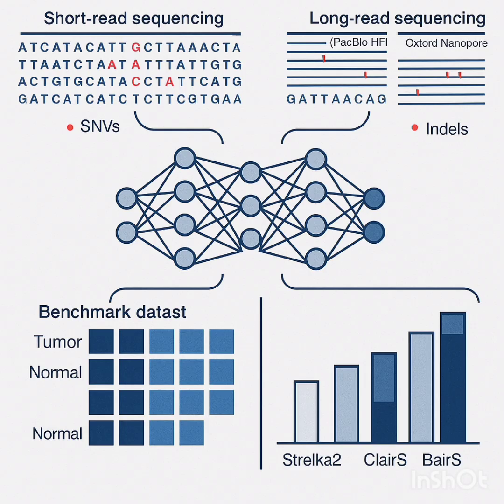They added 263,591 new high-confidence somatic variants to the public domain. Wait, how much does that compare to before? It's a 6.5 times increase compared to that single SEQC2 benchmark set we were talking about. 6.5 times more data. Okay, that's a serious jump.